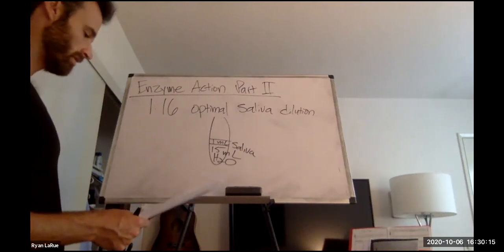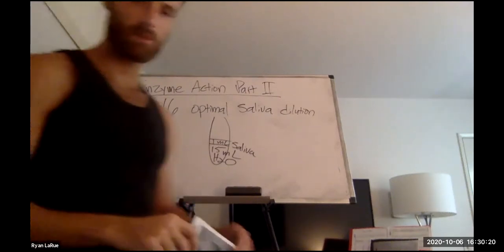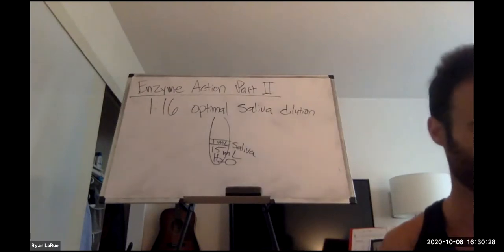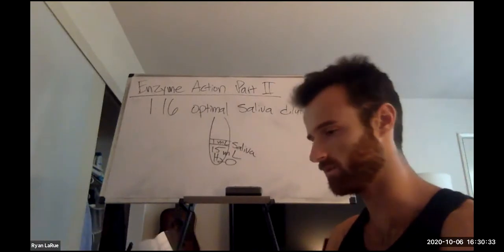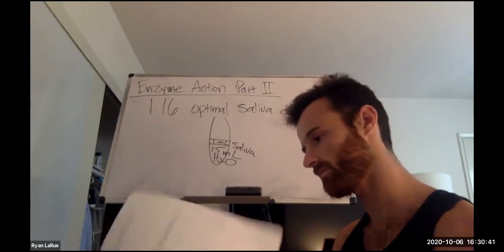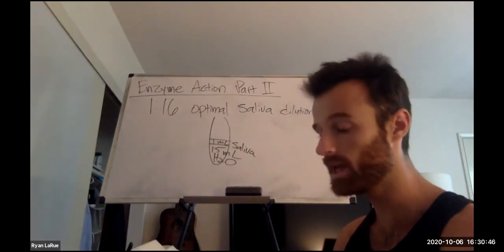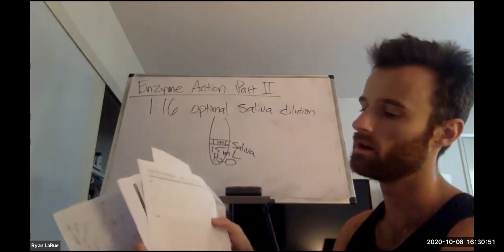Okay, so in this lab, like I said, we're testing different environmental factors. Namely, I believe 3 total. And I sent you the packet info, so you should have this in front of you, right? 3: pH, NaCl, which is sodium chloride or salt, and temperature.